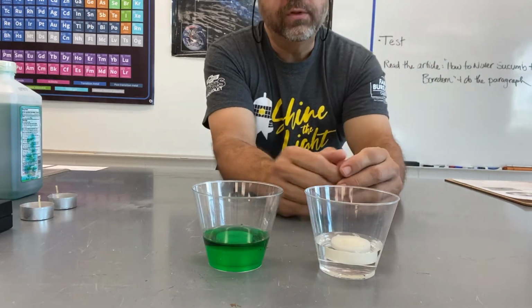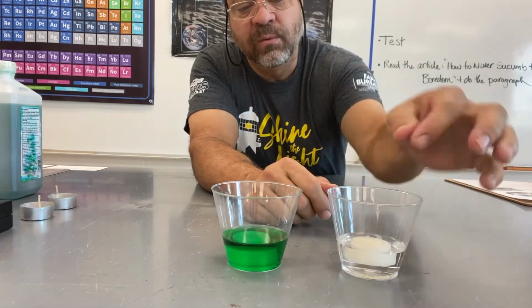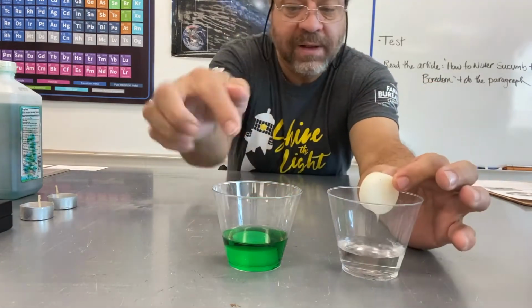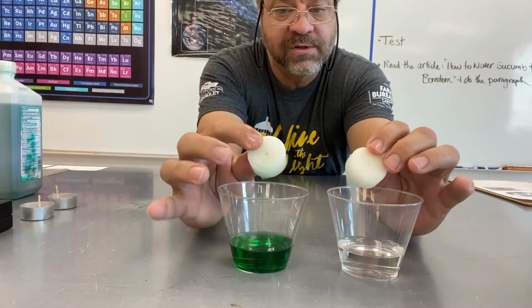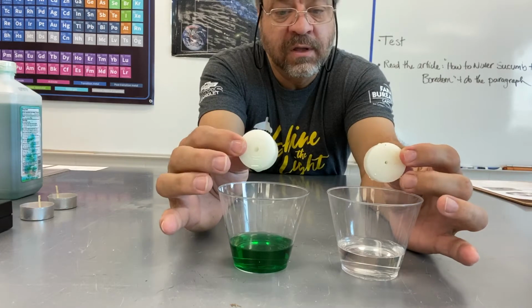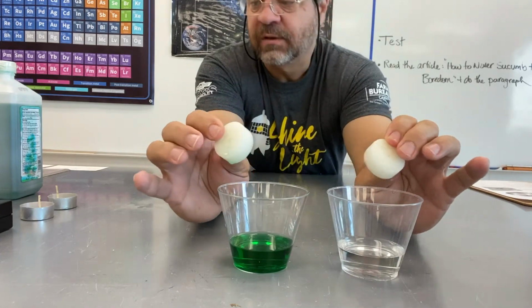So hopefully you're thinking, do these two liquids have the same densities? Because you know that the wax candle in this cup and the wax candle in this cup have the same densities. They're the same exact thing. They're identical. They're manufactured by a machine, and they're as identical as can be. So the densities of these are the same. So it must be the densities of the liquids that are different.